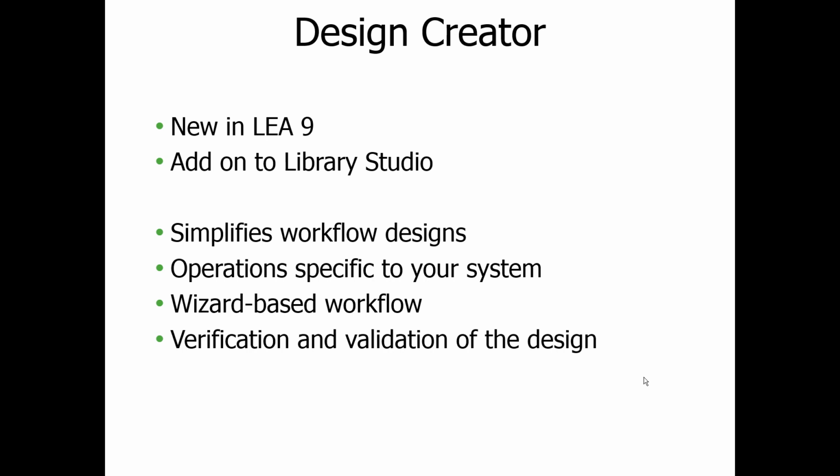That complexity is increased the more types of devices and things that you can automate. This allows this process to be a little bit more streamlined, and it allows you to focus on operations that are specific to the automation system that you're connected to. This goes through a process, sort of like a wizard, so a step-by-step process of designing your workflow, and adds a level of verification and validation to the design you've created that was not present in LEA in previous versions.